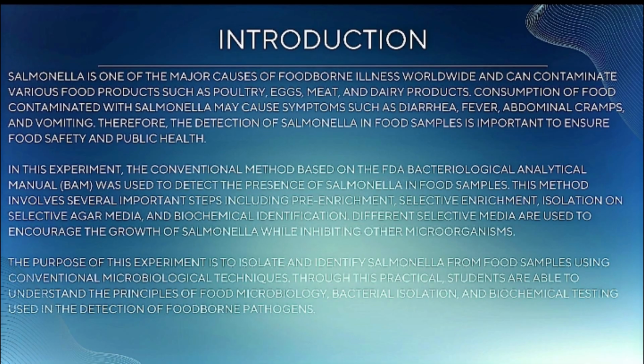The purpose of this experiment is to isolate and identify Salmonella from food samples using conventional microbiological techniques. Through this practical, students are able to understand the principles of food microbiology, bacteria isolation, and biochemical testing used in the detection of foodborne pathogens.